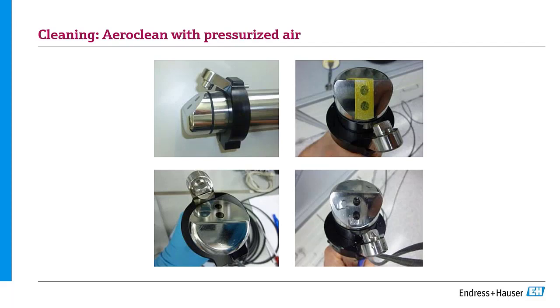Here we have it so that the air cleaning is blowing over the sensor, but is not blowing directly onto the detector. If the air was blowing directly onto the detector, then that would cause false turbidity values and would cause a lot of confusion with our measurement.